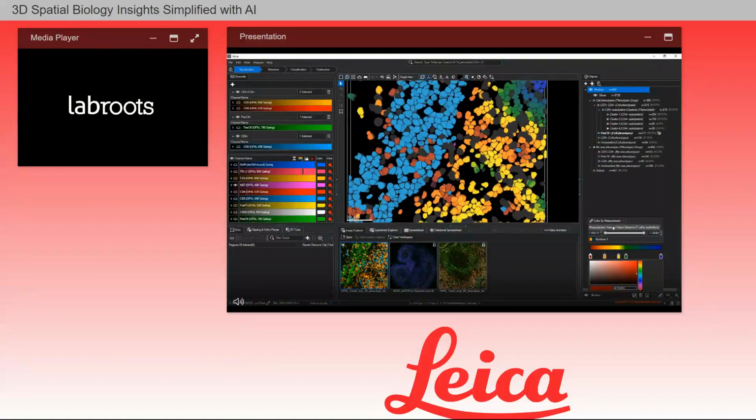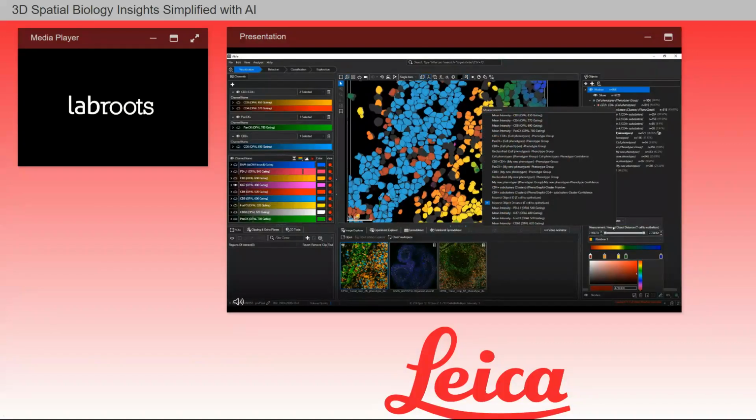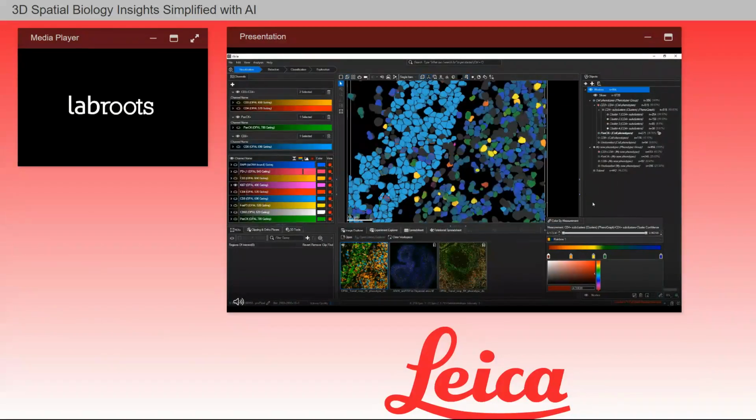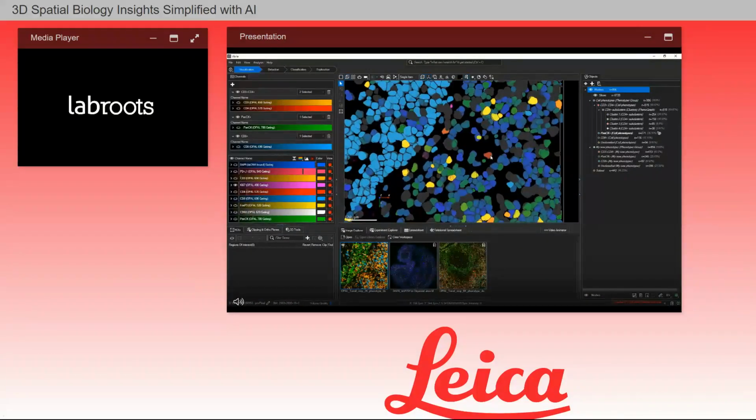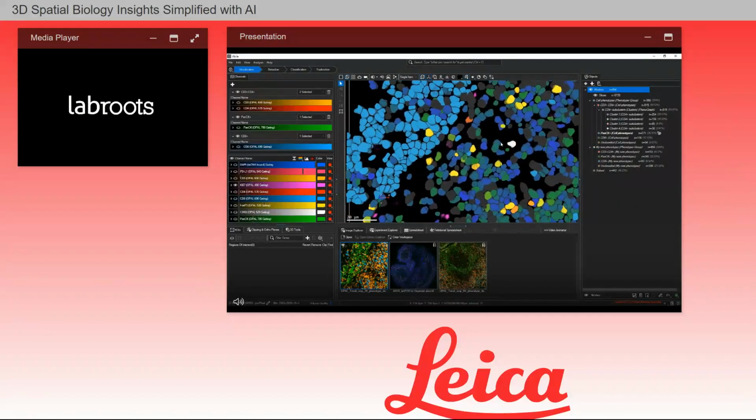Another way to use this feature is for quality control. I will now plot the CD4 subcluster confidence. What this shows me is the confidence assigned to each object that is placed into a cluster. I can look more closely at the cells that are red and orange in this view. These are my lowest confidence value cells. And using the tools at my disposal, I can then decide whether these cells are misclassified, in which case I can either update my object classifier or remove them from analysis. This is a great way to verify my analysis.